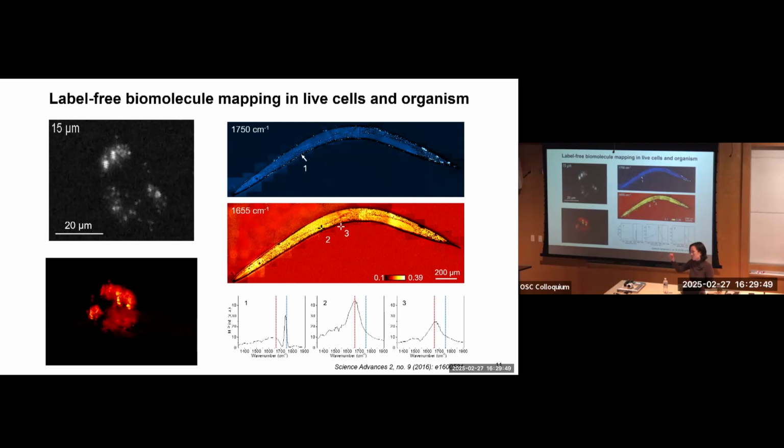But if you have a particle sample, then your scattering is changing, and it's also related to what medium you are embedded in. So the index mismatch and also the thermal gradient are changing. For the exact mechanism, we are still trying to model that. But that's also a very good question.